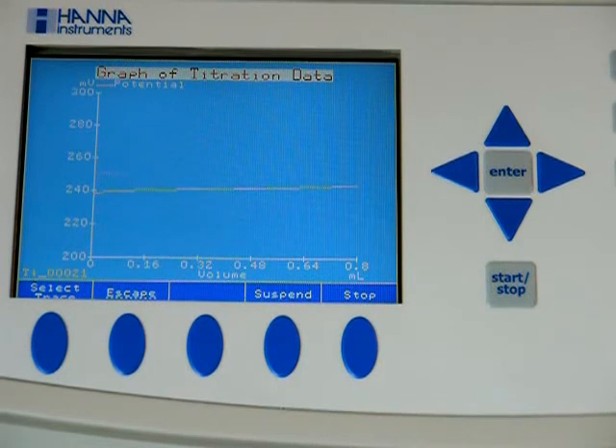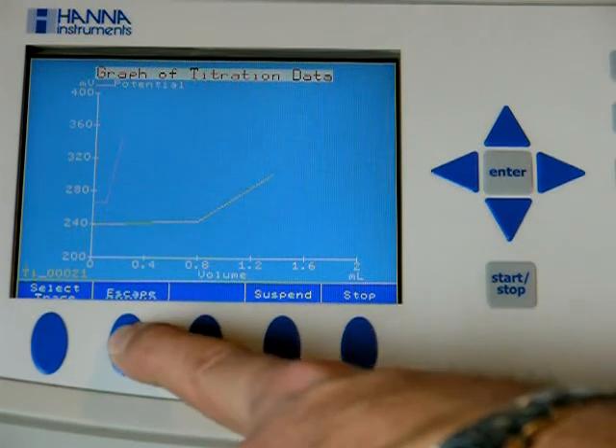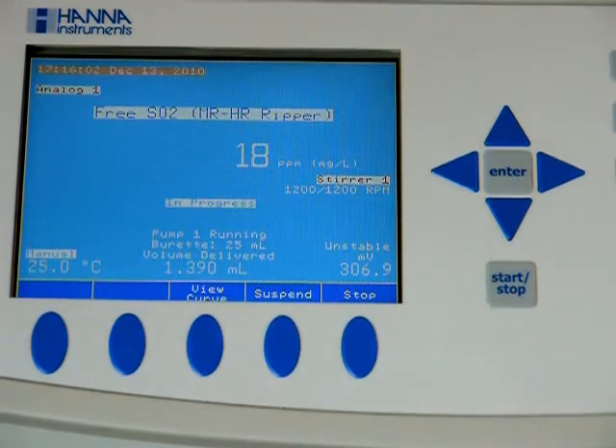You can hit the view curve button. We'll show you the titration curve as it develops. You can suspend or stop the test and escape out of the titration curve and go back to the main page.